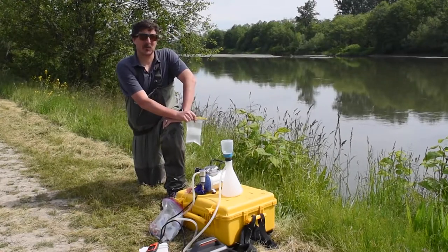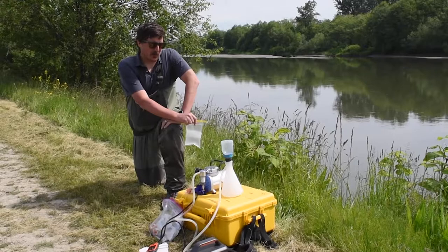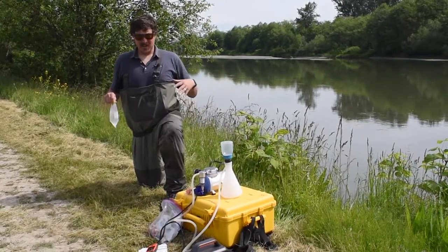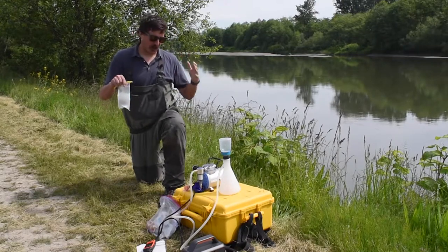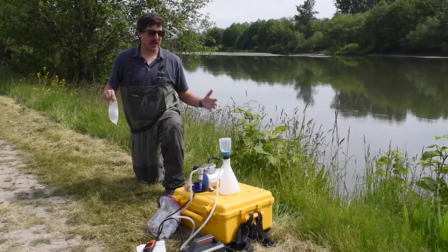I just went out and collected a water sample from this river. When you're collecting a water sample, you want to make sure you're doing everything you can to not contaminate it by collecting upstream of where you're standing or kicking up a bunch of muck. This is what I call my front country eDNA kit, and I'll briefly talk about my backcountry eDNA kit.